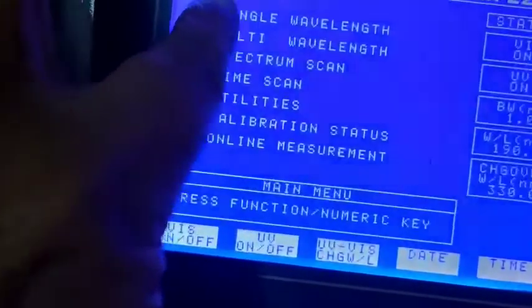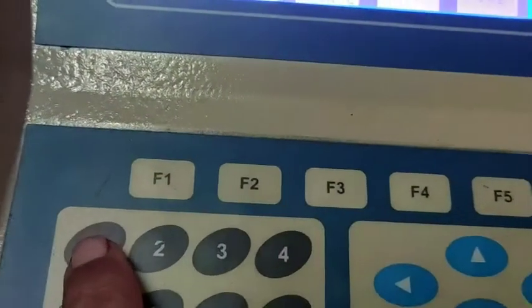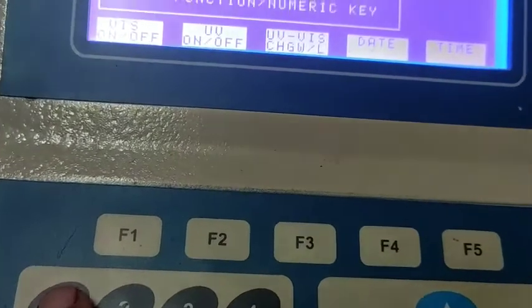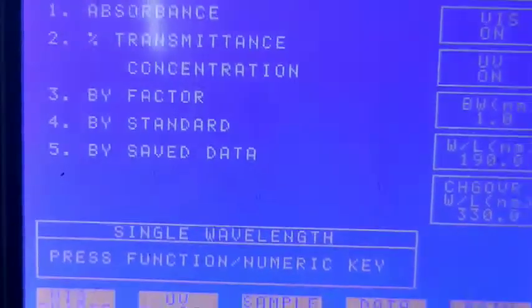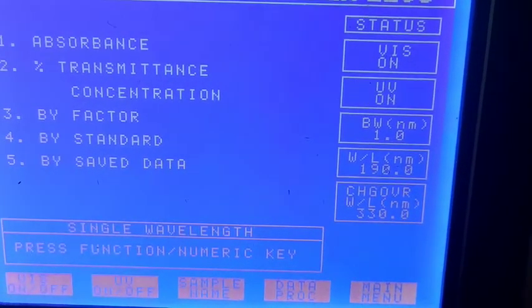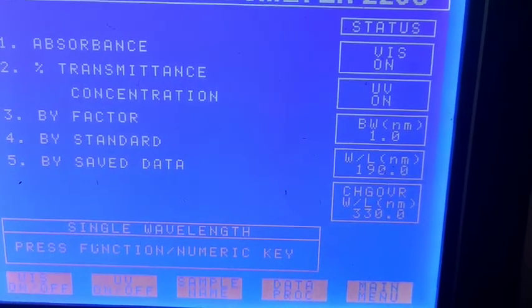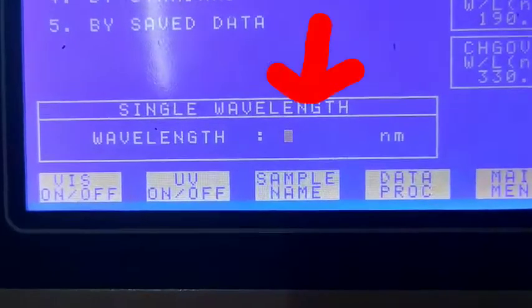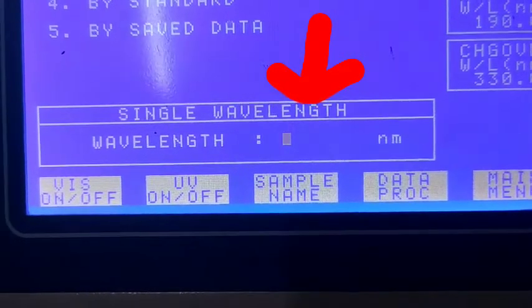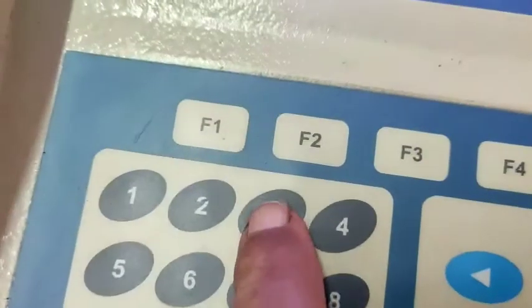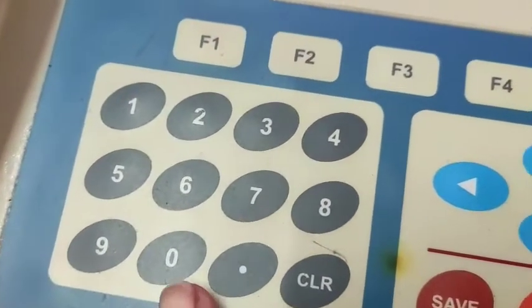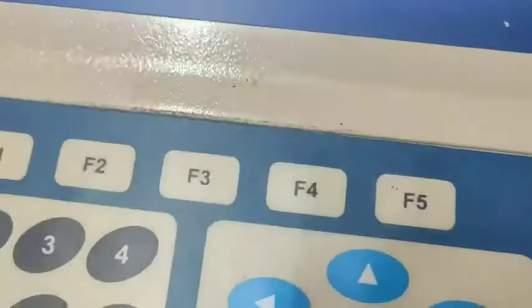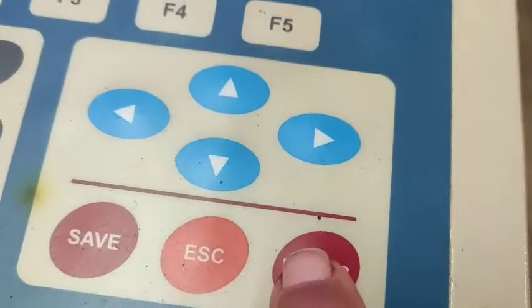The translucent side will be towards you, and the transparent side on the side of the spectrophotometer. Cover the sample chamber during the experiment. Press 1 for single wavelength. It will show the next screen asking whether you want absorbance, percentage transmission, or concentration factor. Since I want absorbance, I will press 1. It asks on which wavelength — I will enter 360, because potassium permanganate absorbs at 360 and 550 nanometers. Then press Enter.